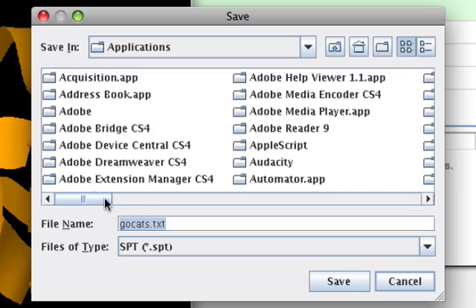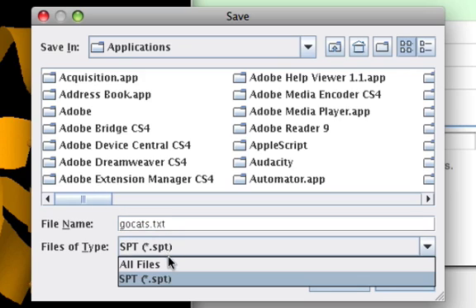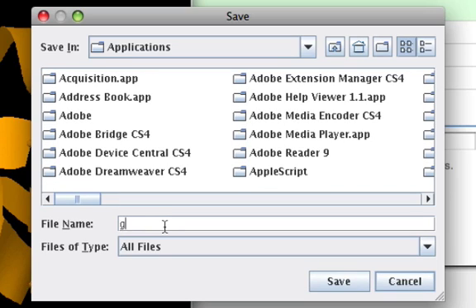When saving a state file, be sure to change the file type to All Files and save it as a .txt.